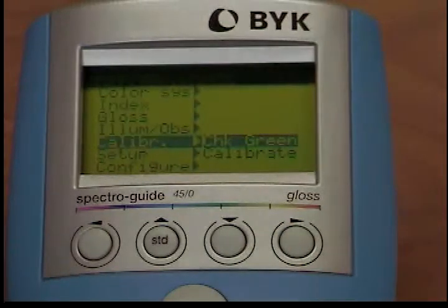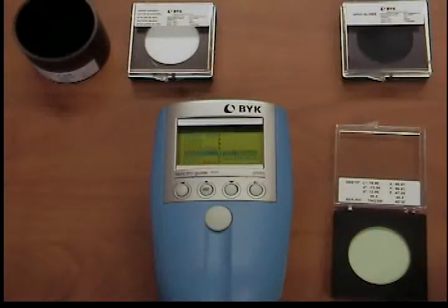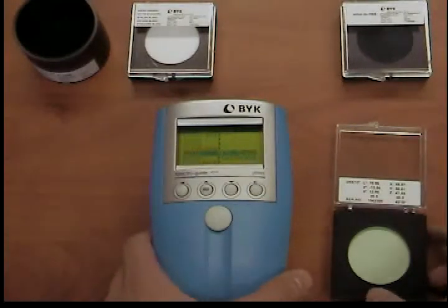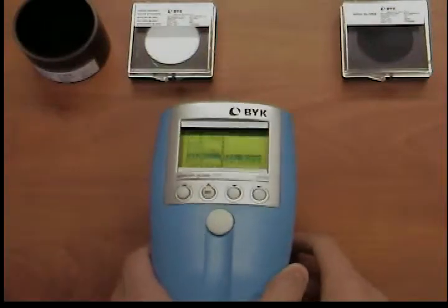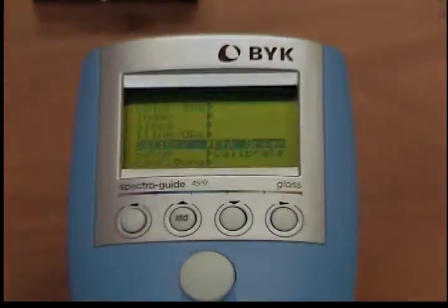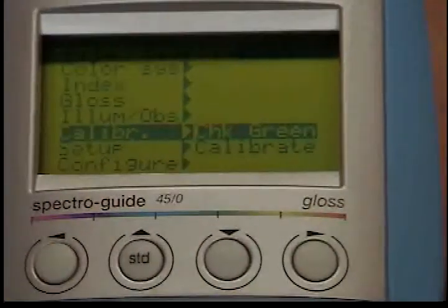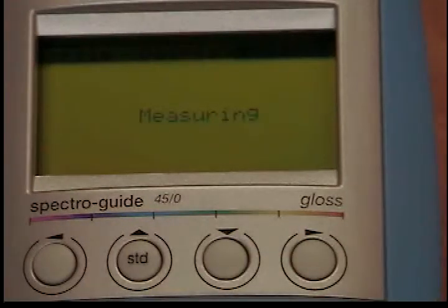Take the green test standard and flip the open lid. Position the measuring instrument so the display points in the direction of the open lid and the front edge of the instrument is parallel to the edge of the lid. Press the operate button. You will then be instructed to measure the green test standard. A message will then appear indicating whether calibration is still valid.